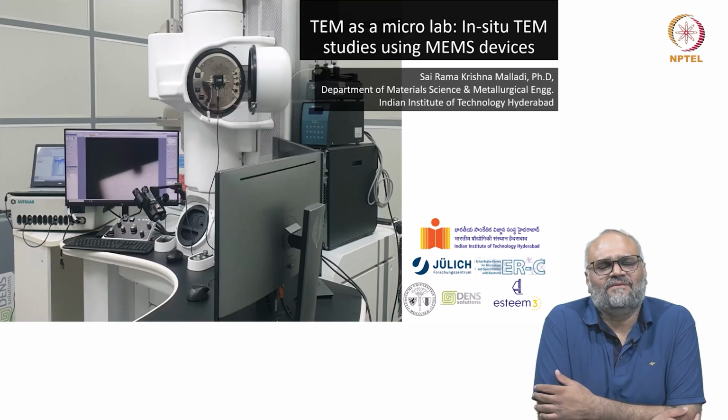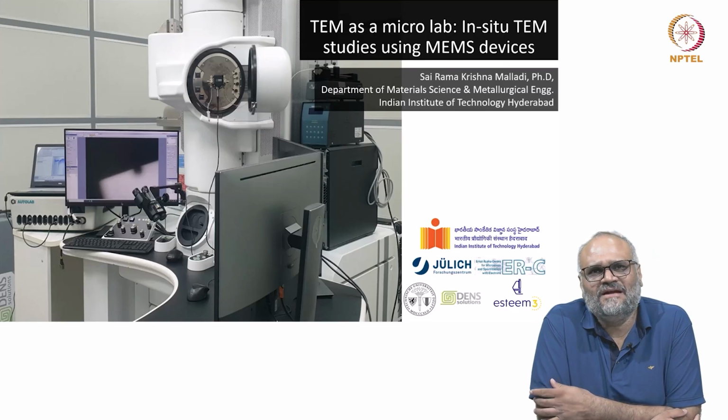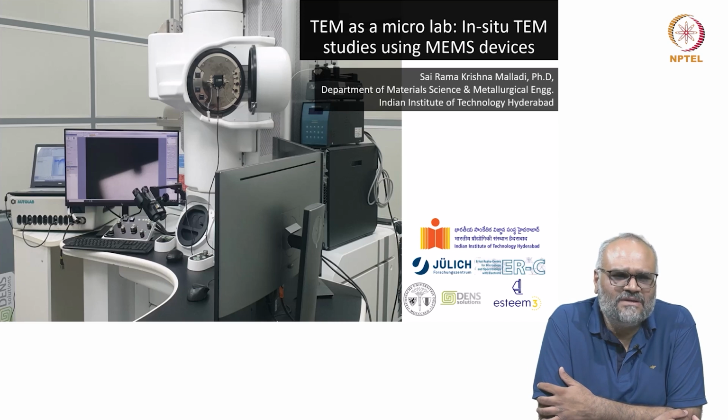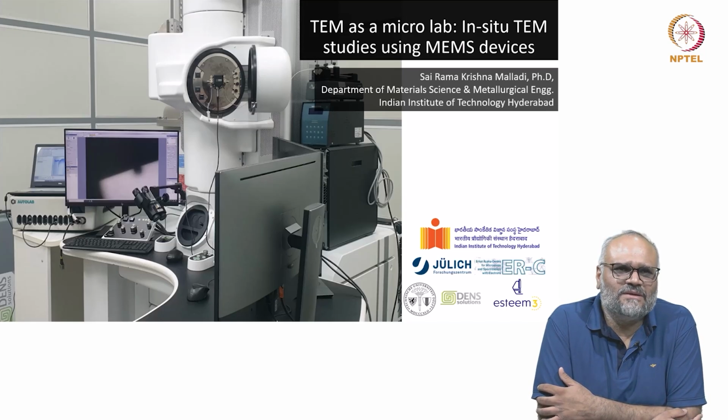So in this course, having covered various operational modes of transmission electron microscope and understanding the physics behind image formation, and also looking at different kinds of examples and some brief tutorial sessions on how to obtain and analyze data, I'll give you in this particular lecture some examples of more recent developments in the techniques of electron microscopy, in particular in situ electron microscopy.